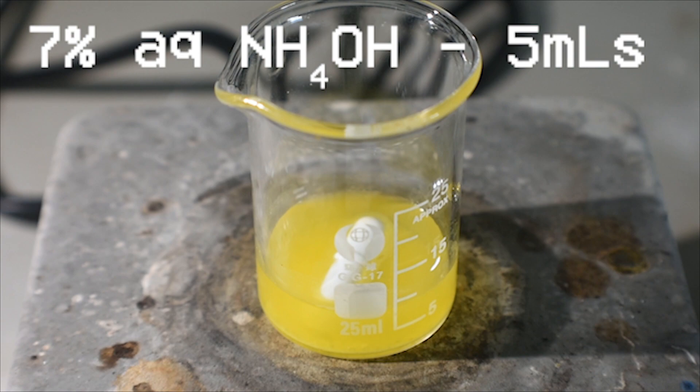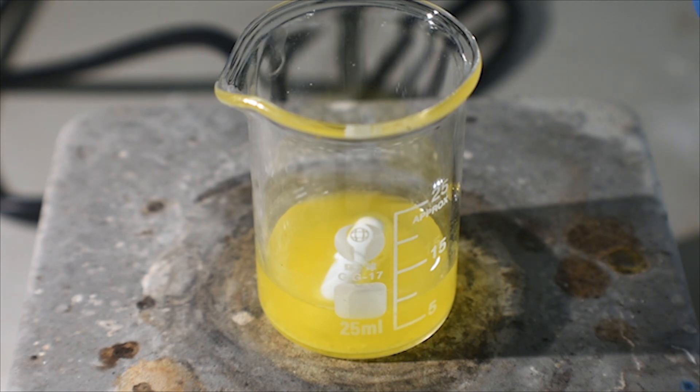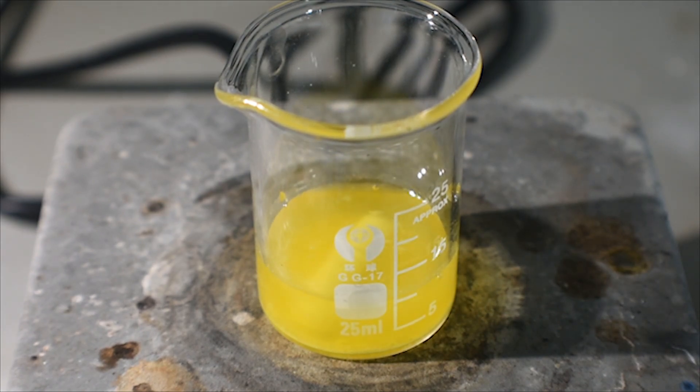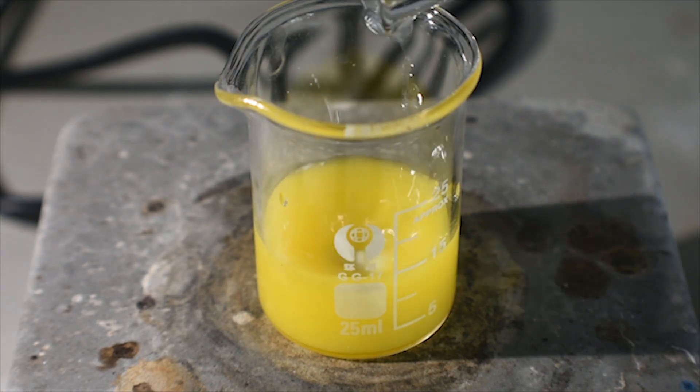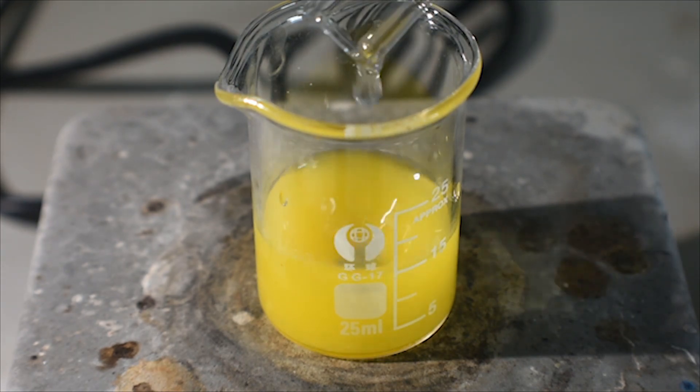5 ml of 7% aqueous ammonia is added. Stirring is turned on. And shortly, we should see the formation of a bright yellow powder. You may be able to see some of that forming right now.